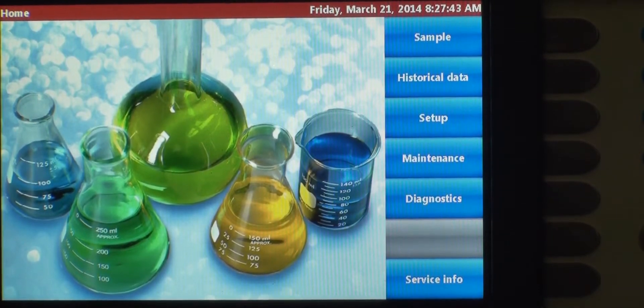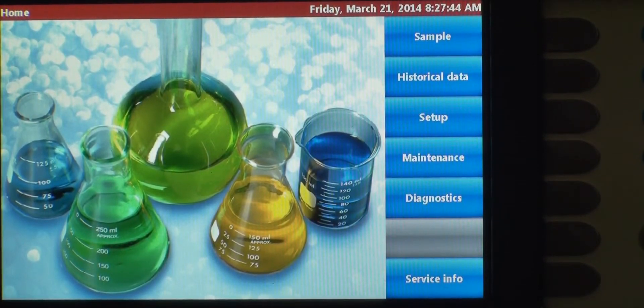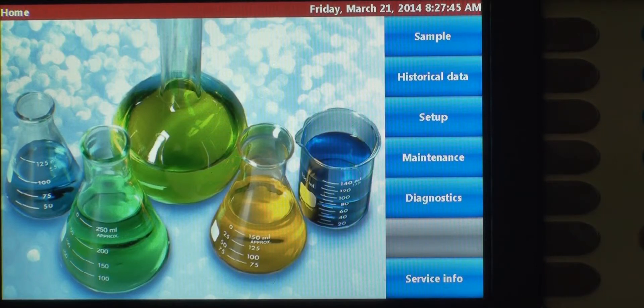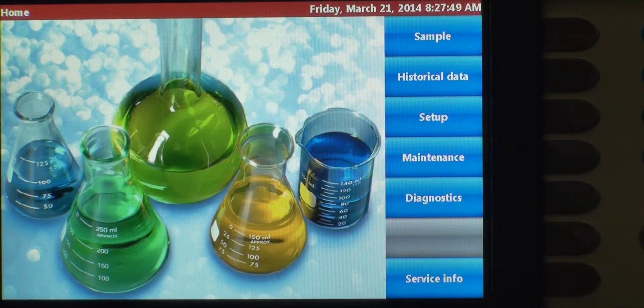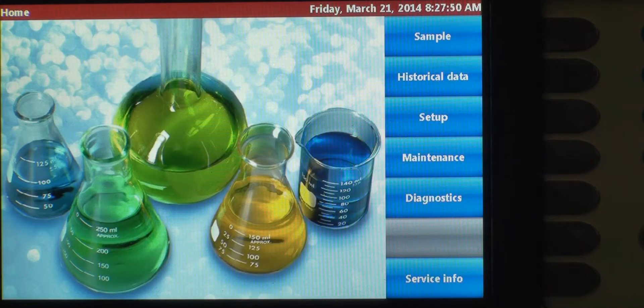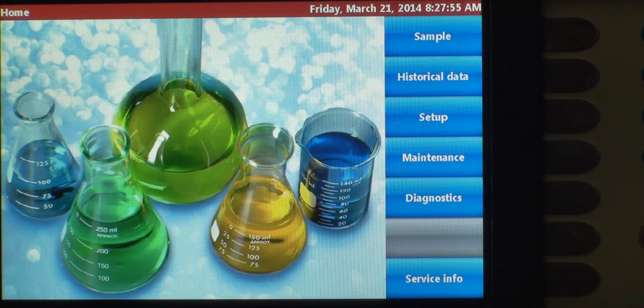For the next few minutes, we're going to go through the process of creating a sample recipe, saving that recipe, and then we're going to run a sample using that recipe. This is a common function that you'll have to do with the 8011+.